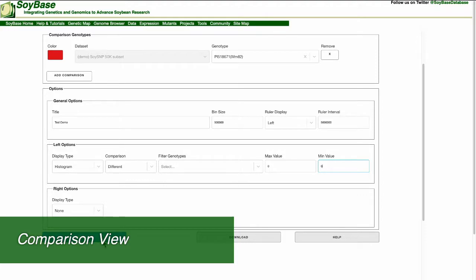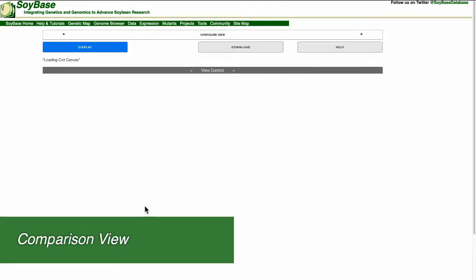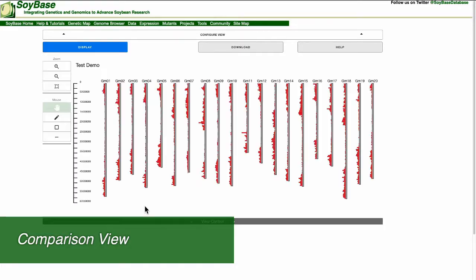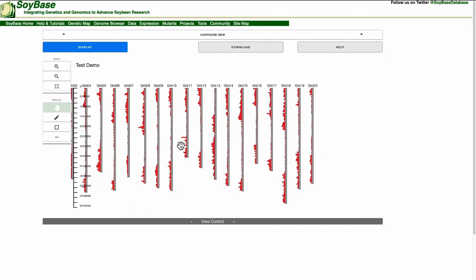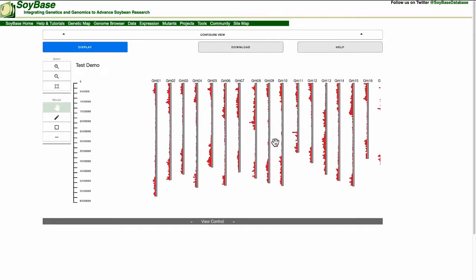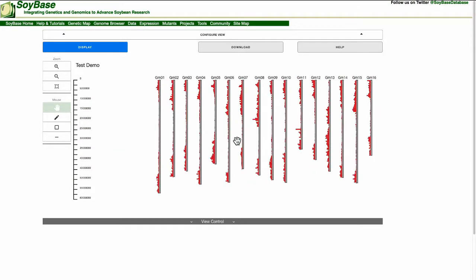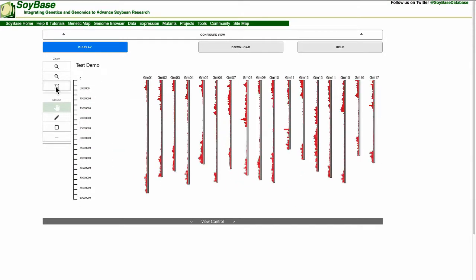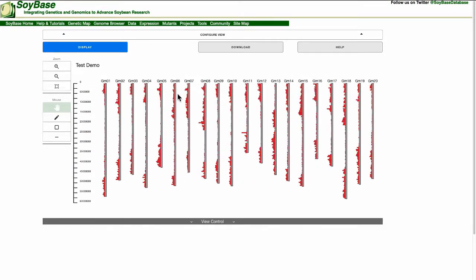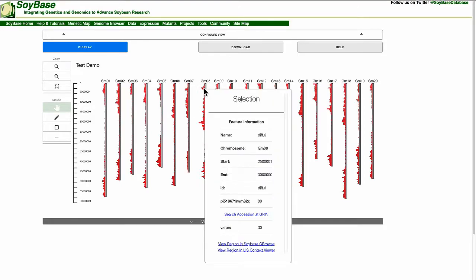The display screen is interactive. We can move the picture left and right to see all of the chromosomes. If we click on a bin we get more information about that bin.